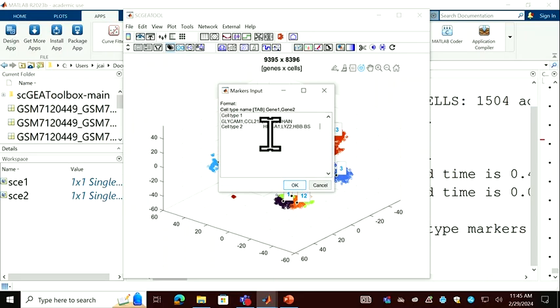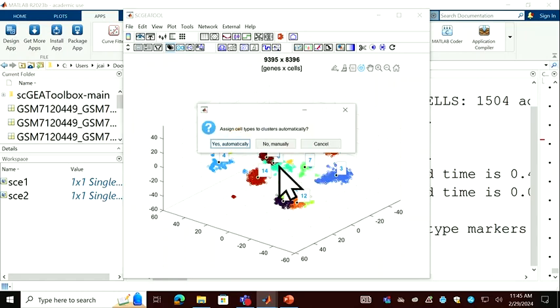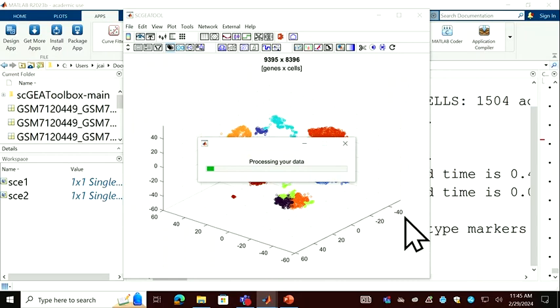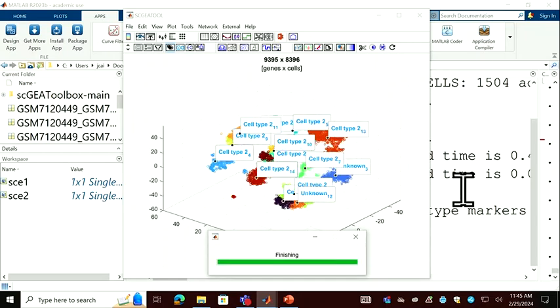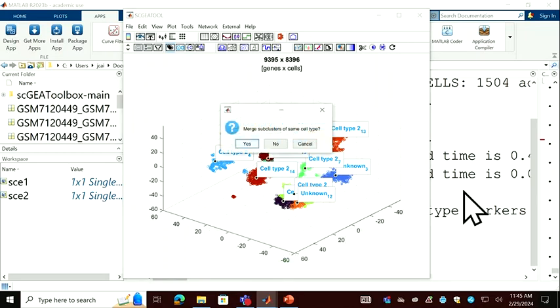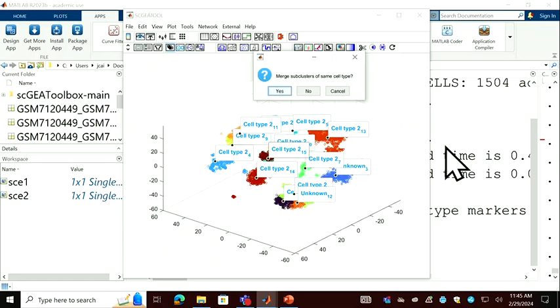But if you use this customized gene marker, you can start to predict. So you see, okay. And if you do it manually, the algorithm will still run, okay. But the output is only cell type 1 and cell type 2. That's based on your definition, okay.